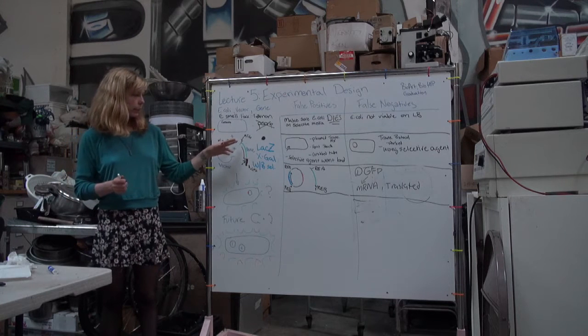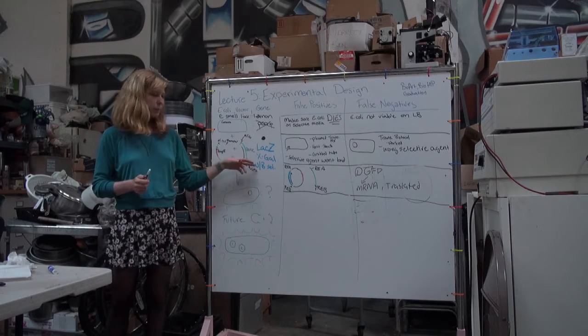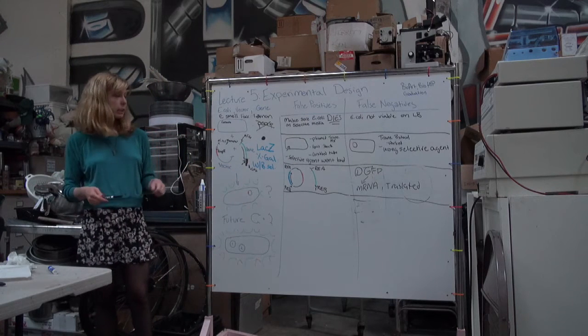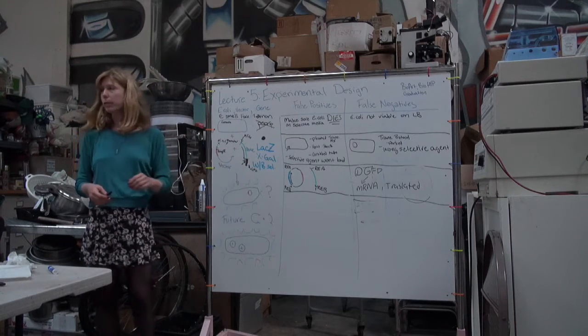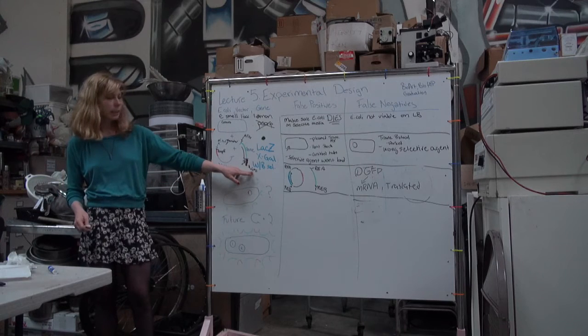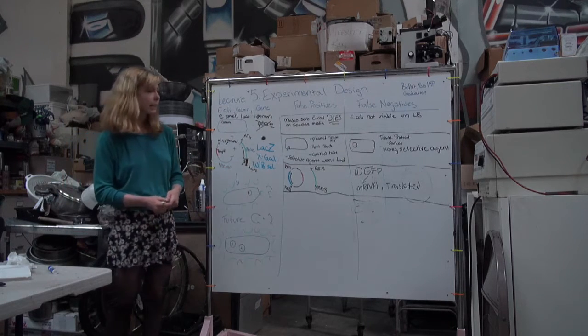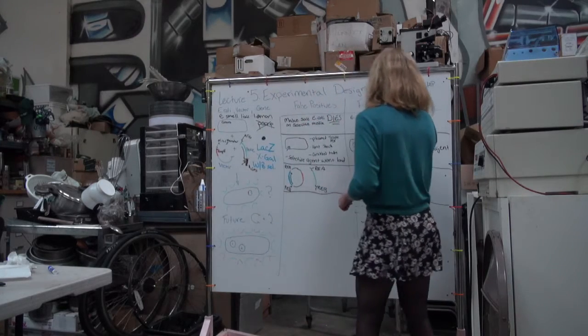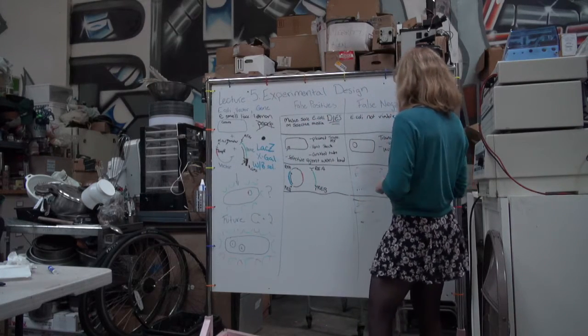Now, you also want to make sure GFP can be seen. You want to have that as a control as well, because it could just be the promoter you're selecting, or how close it is to the promoter, or something else that's going on, that is affecting why you're not getting GFP. So when you're not getting GFP, this is actually false negatives.